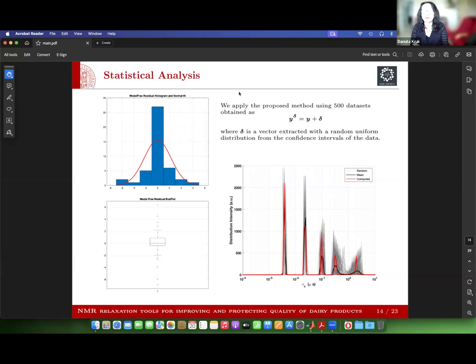I suppose it's like, let me put it in this way. You have, for instance, biological molecules, and you have those quadrupolar effects, which I'm going to talk about. So you have a proton-proton relaxation contribution and a proton-nitrogen relaxation contribution. The proton-nitrogen contribution gives you those peaks, yeah? So I suppose Adriana is asking whether your software takes it into account somehow, that there are proton-proton and proton-nitrogen relaxation contributions. Okay.